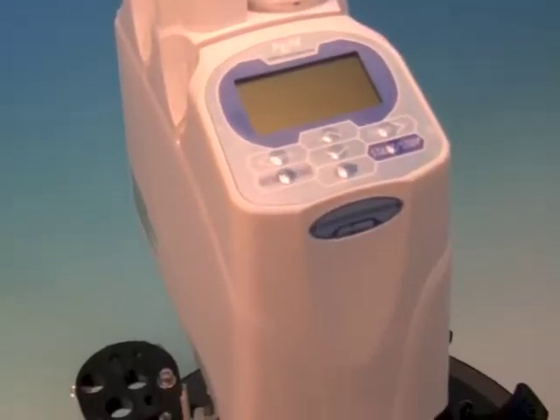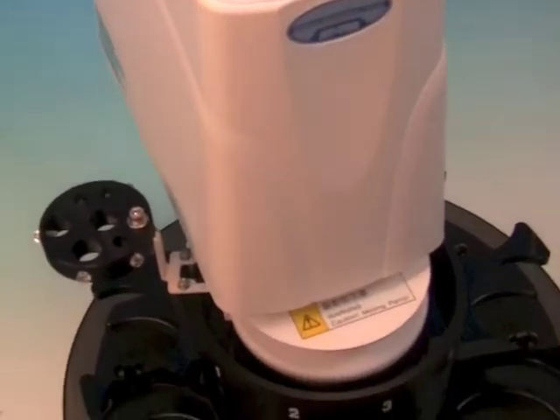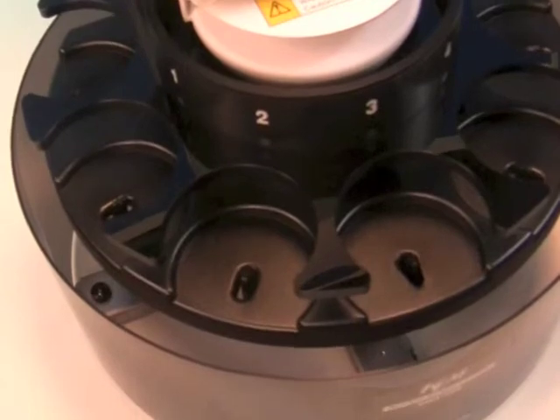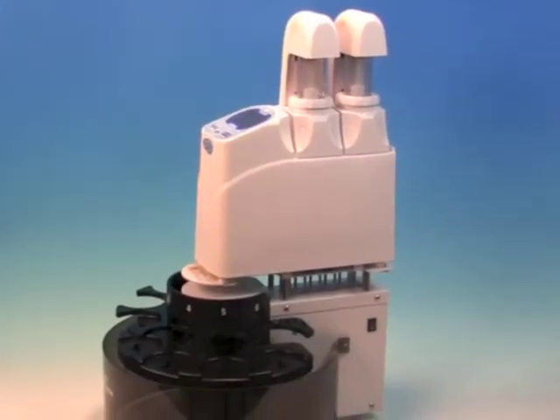The AT700's vertical and compact design is well thought out. The electrodes and nozzles are maneuvered around to each sample position instead of the traditional turntable style.